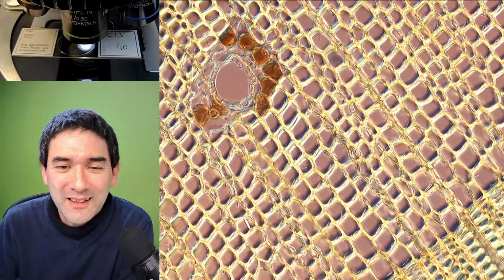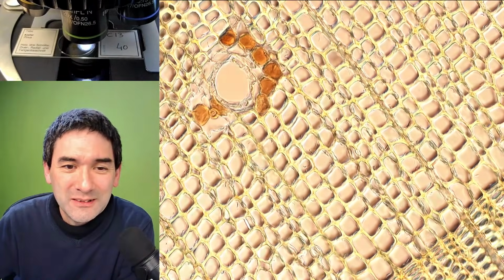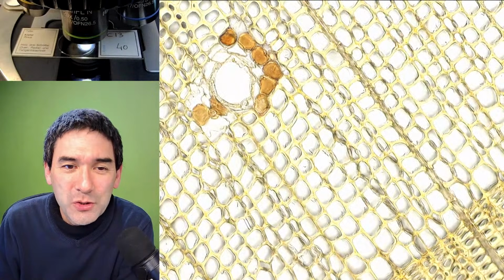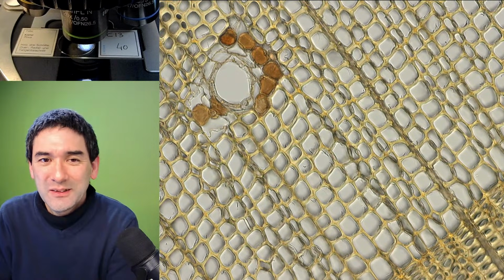So again, the individual cells here, and regular bright field. You see how much light it takes away. Yeah, it looks like this.